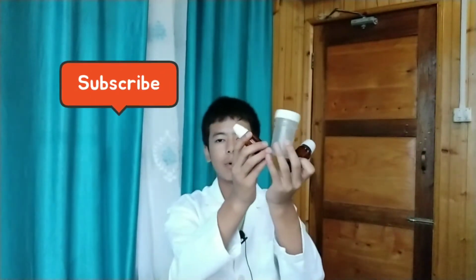And the next thing is some collection bottles or collection tubes like this. They are very handy in the field of microscopy. This kind of container I usually use for collecting samples from lake sides and forest sides. At places where microscopy materials are present in abundance, I collect those things in these bottles. This one is for solid materials, these two are for liquid, these two also for liquid, and this one is for slimy things, this too for slimy things, like slime or algae growing in patches.